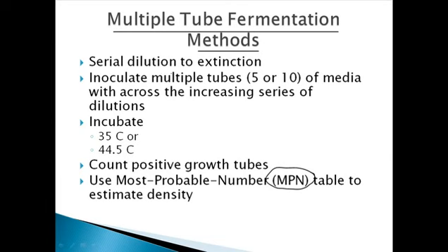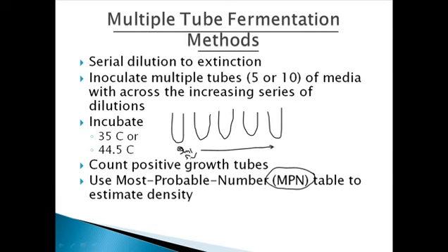What is a serial dilution? In the serial dilution technique, we have several test tubes. In the several test tubes, we are taking, for example, 9 ml of broth, or nutrient broth, for example. 9 ml of distilled water, 9 ml of sterile water. In all those tubes we have 9 ml of sterile water. What we are doing in this case, we are adding 1 ml of the water to be tested there. The water contains the coliform.